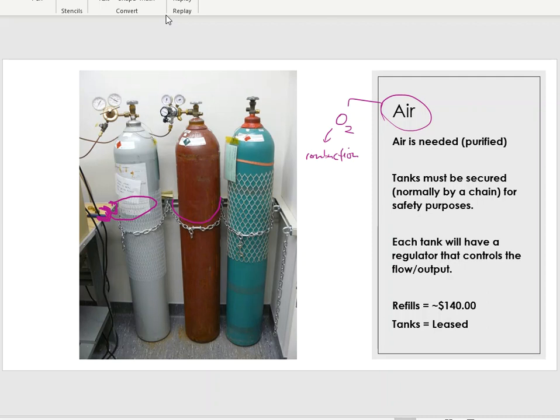If you don't have a wall railing, you can order clamps that attach to a table and chain the tanks that way. It really depends on the location, the laboratory, and how much room you have. The three tanks in the picture likely serve other pieces of equipment in the room, not just the TOC. Each air tank normally costs us around $140.